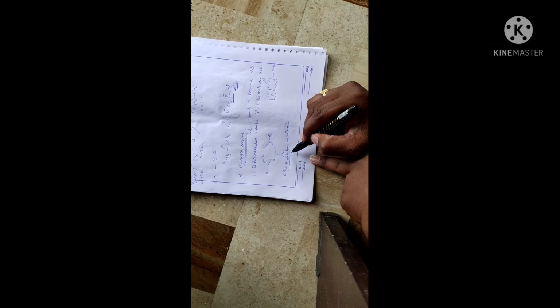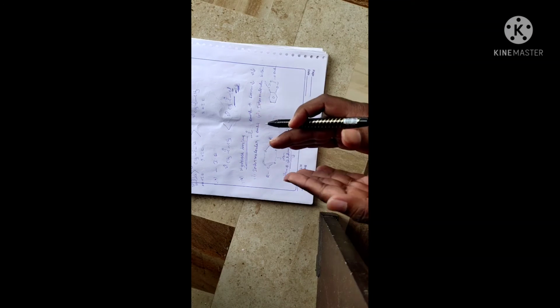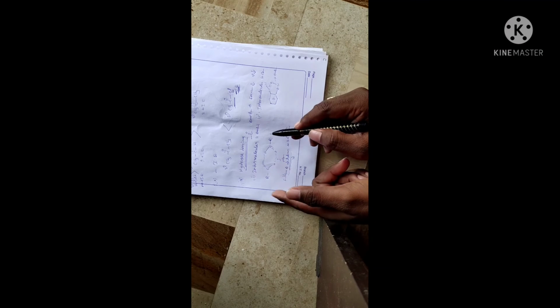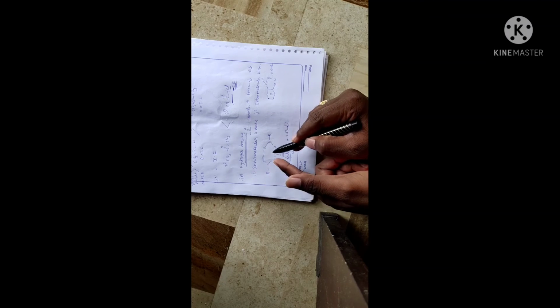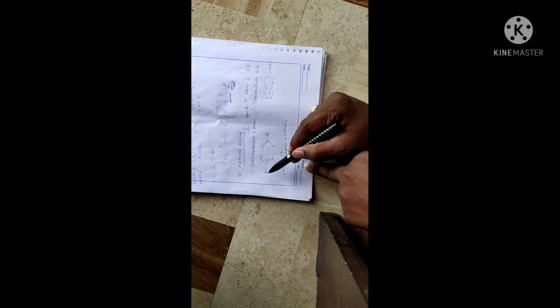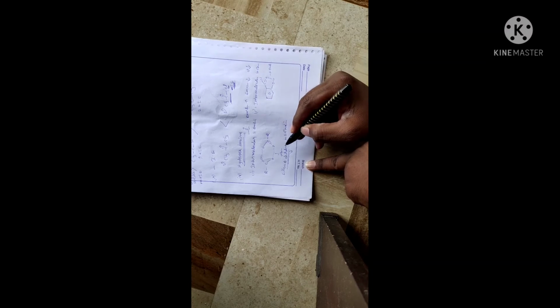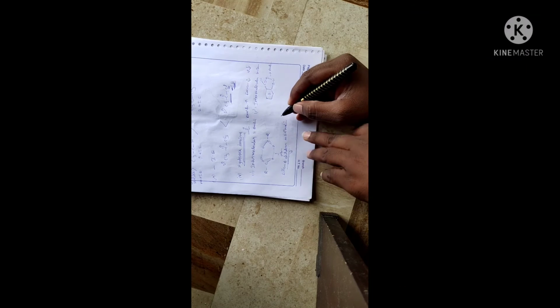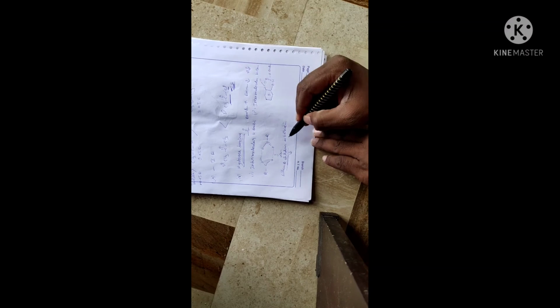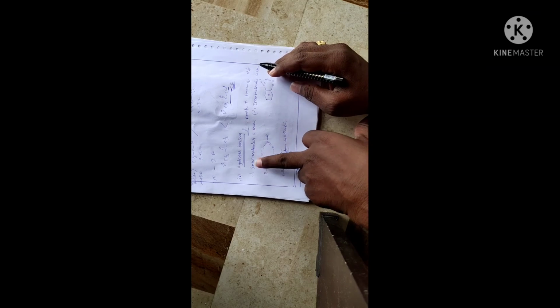As the two molecules go away from each other, an increase in the frequency takes place. This means the effect of dilution is present in the case of intermolecular hydrogen bonding.